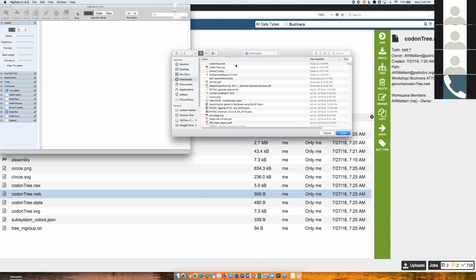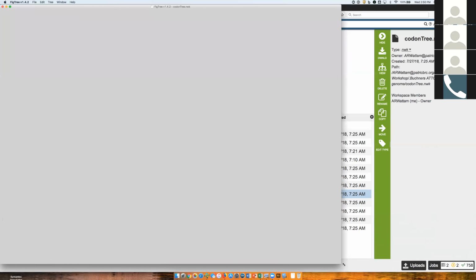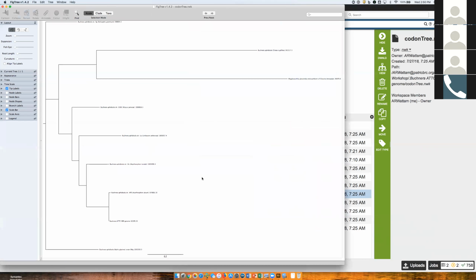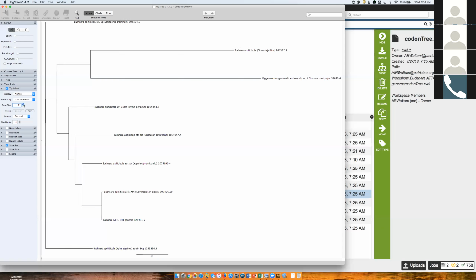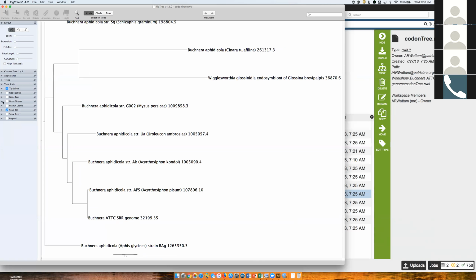Here we go. And we run the bootstrap. So, oh, sorry about that, everybody. I'm going to get it for you here. So, an unimpressive tree at this point, but I can go in. This is what I like about Fig Tree. I can increase the font on it, so I can make it as big as I want. The bootstrap values are in node labels. I just called it support for here. So then I can see how well supported the tree is.